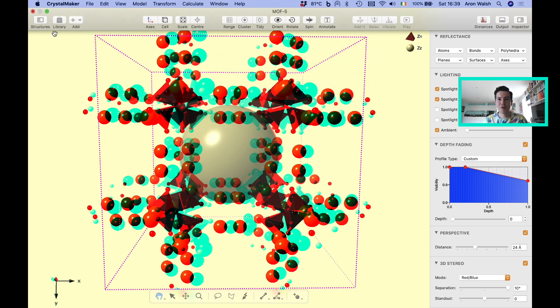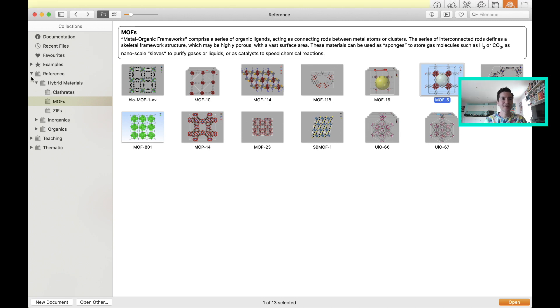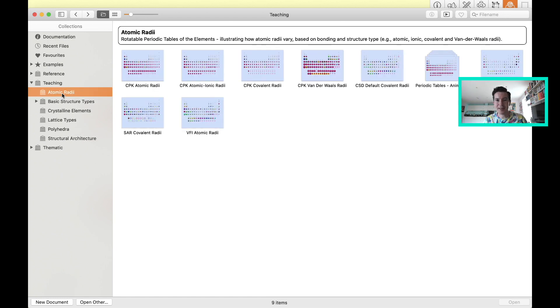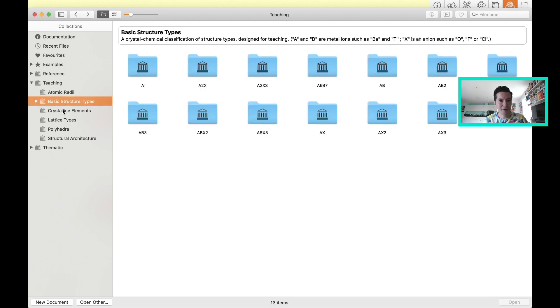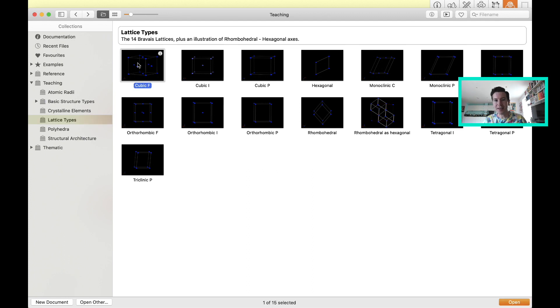That's just playing around with one structure. In the first class we covered lattice types, and there's actually a whole section on teaching. In teaching, you can see things like the radii of elements and different structure types, which we'll cover later in the course. What I'm interested in now is lattice types. There are example structure files for the 14 Bravais lattices, giving you a chance to interact with each one to understand them better. I'm going to open up a cubic F lattice — the face-centered cubic.